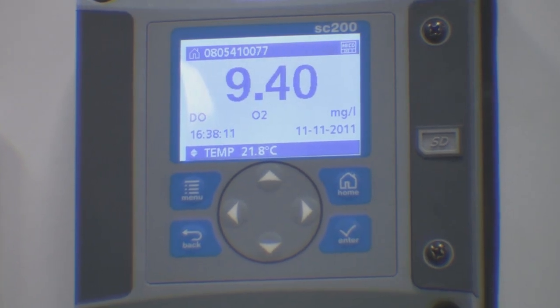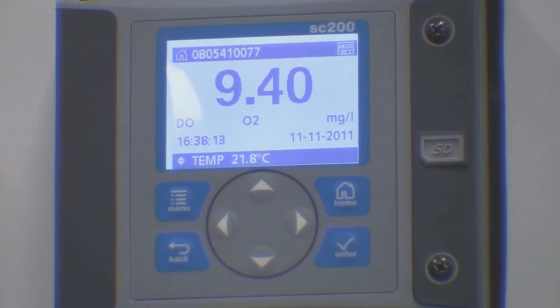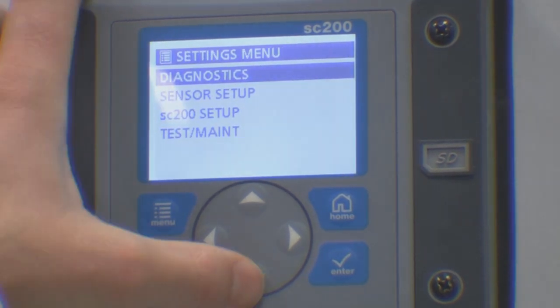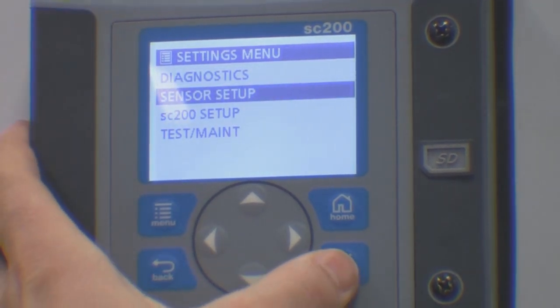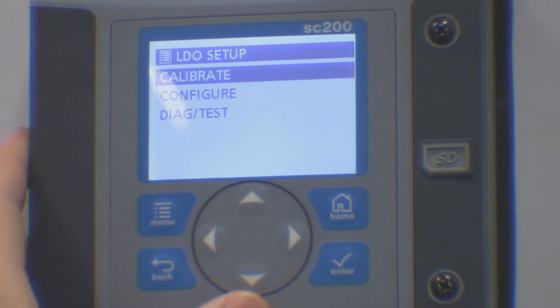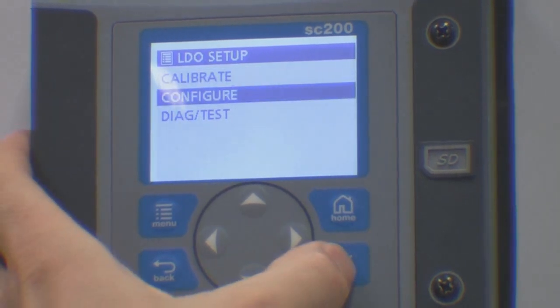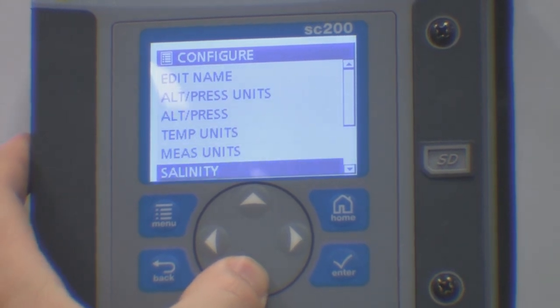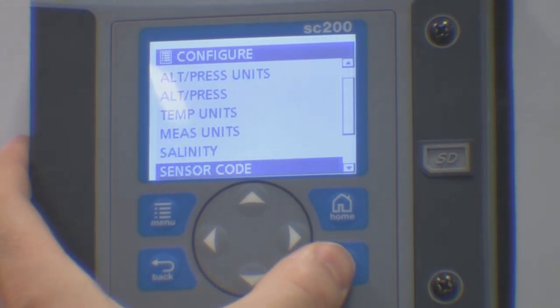You enter the code via the menu in your SC controller like this. Select the menu button and then select sensor setup. If you have more than one sensor connected, you would have needed to select the correct sensor. Now select configuration and then scroll down through the menu until you find sensor code.